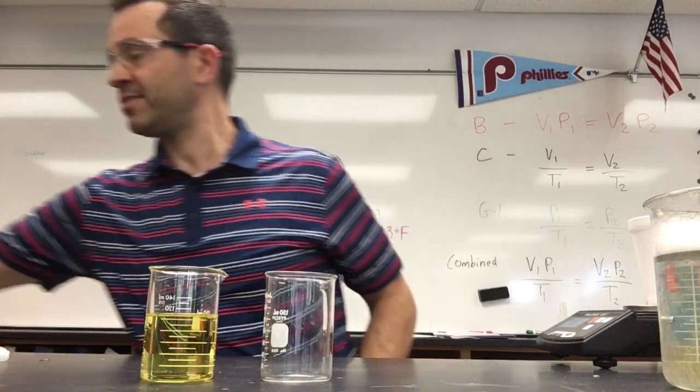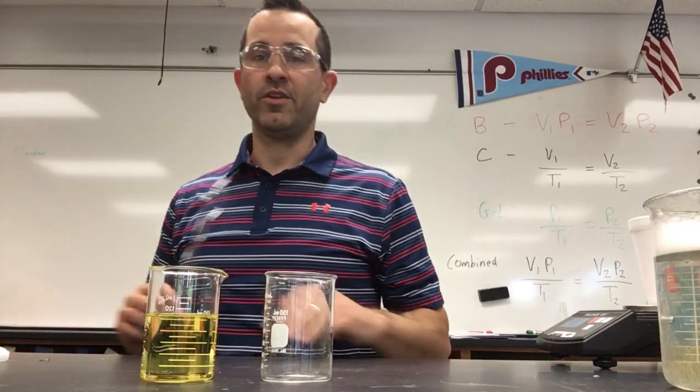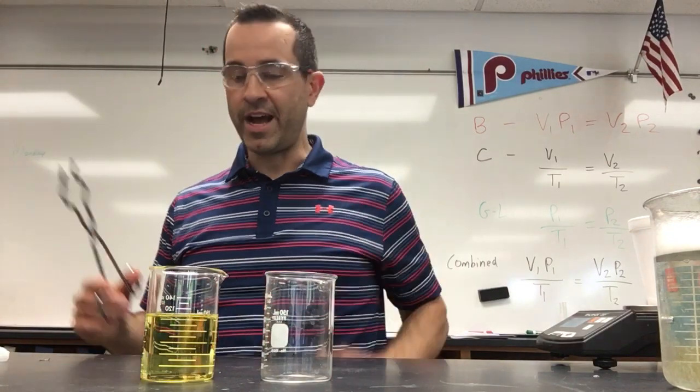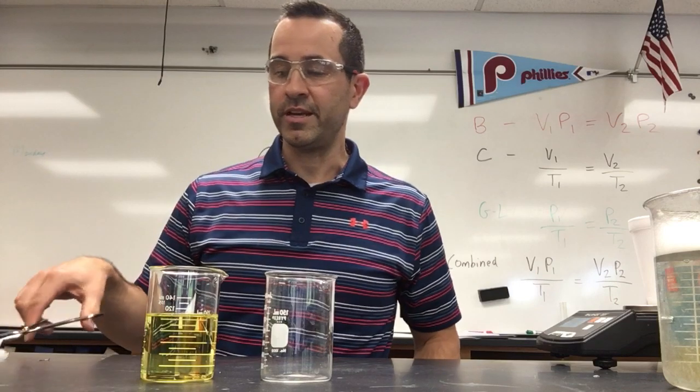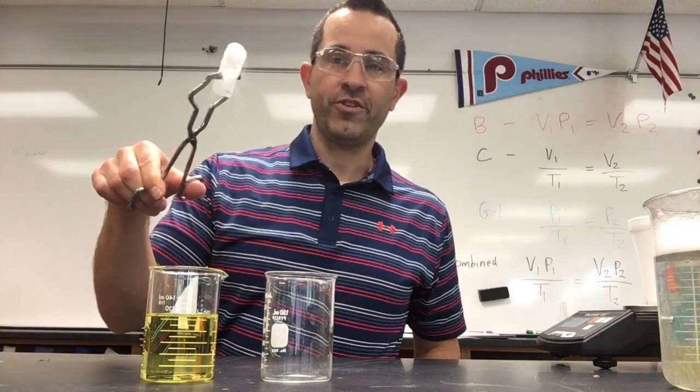We're going to do our density of a gas lab, unit 11. Since we're studying gases and we just looked at the equations that we can use to solve for density of a gas, figure we might as well have a little fun. So we have some dry ice with us today. Oh, it's angry dry ice.